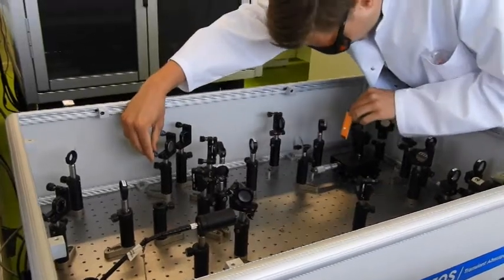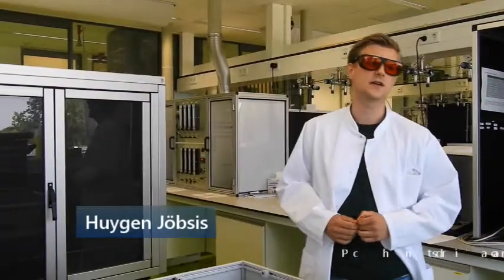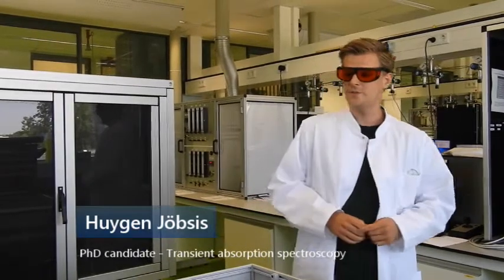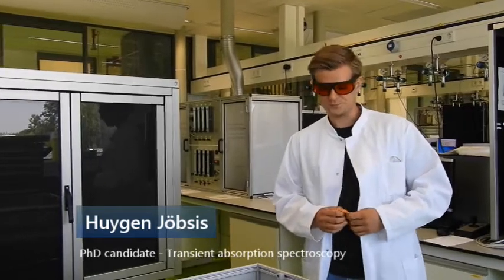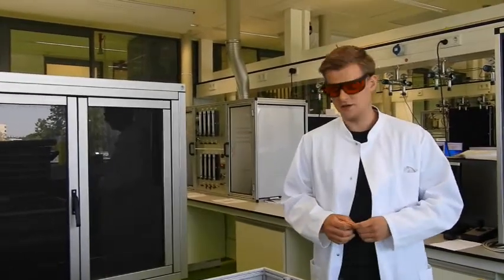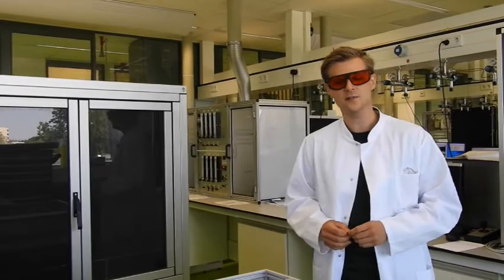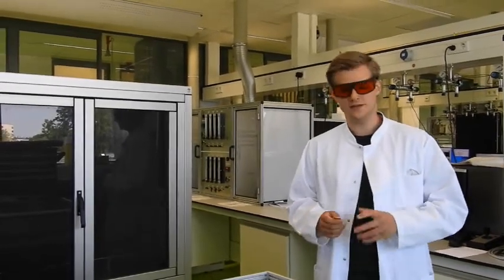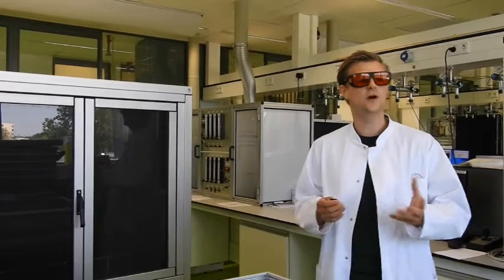Right, so another way to study these catalysts is by studying the charge carrier dynamics. We do this using transient absorption, this setup. This setup uses two pulse lasers to create these charge carriers, and by changing the time interval between these pulse lasers, we can get an idea of the charge carrier population over time.